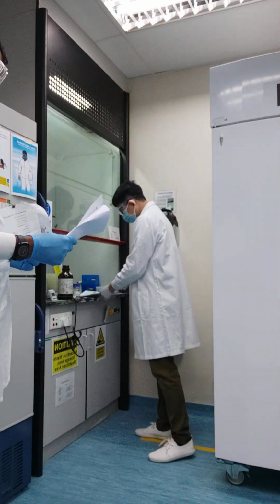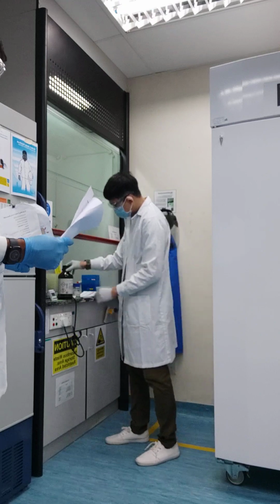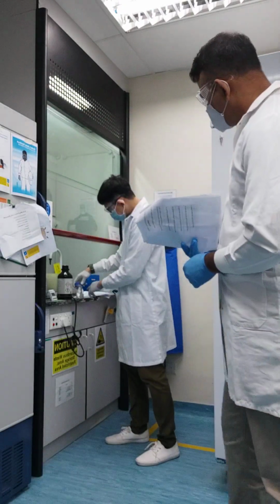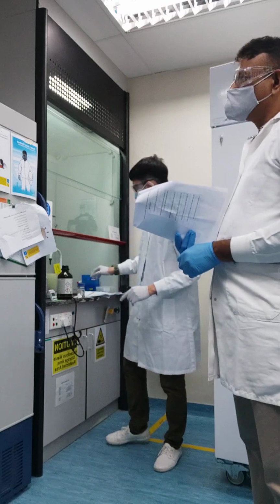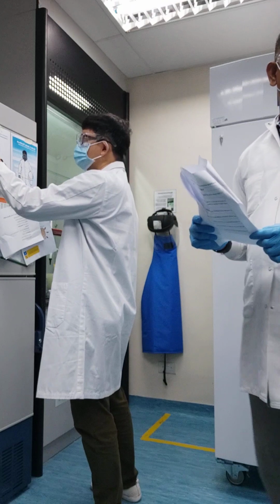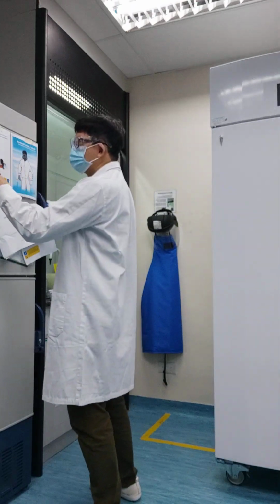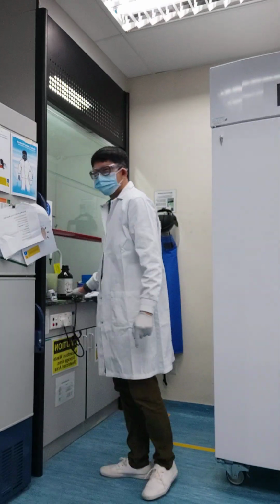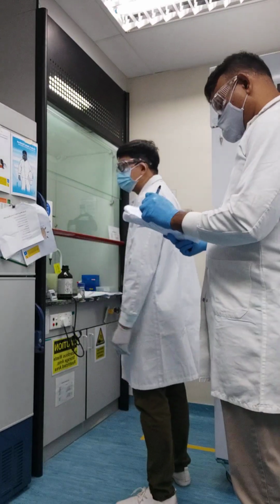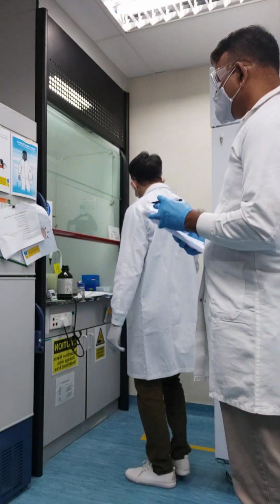The next thing is I need to check the symbol on the label. I don't know what this symbol is, so I look at my reference chart. My reference chart says that this symbol is corrosive and this symbol is irritant. So I already know the physical hazard. The next thing is, before I start, I need to wear the PPE.